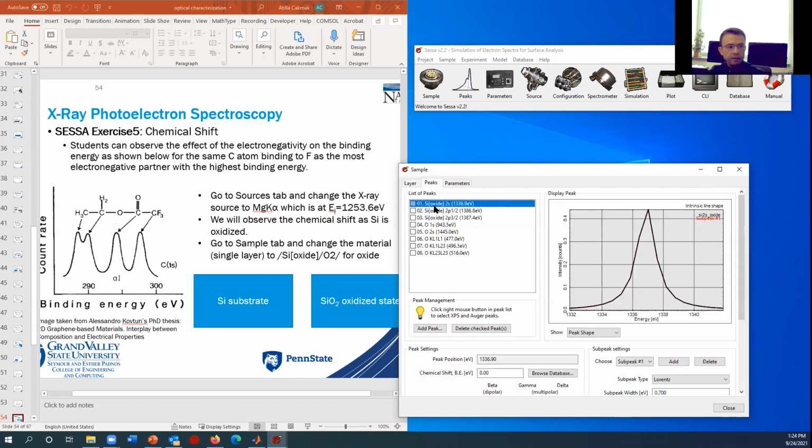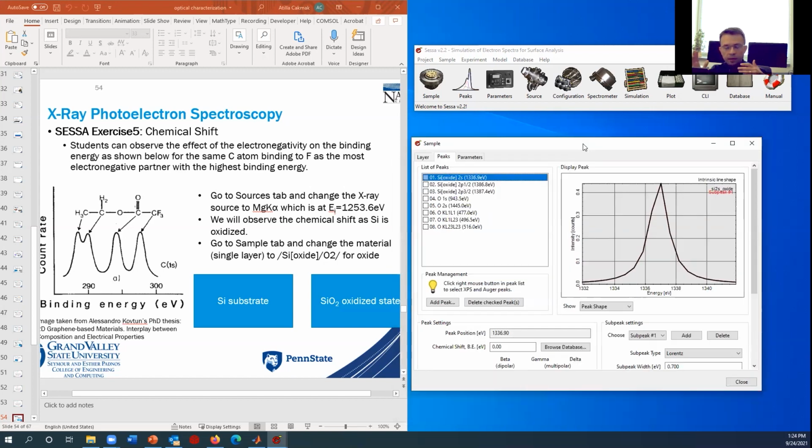And if you look at the peaks, it will bring me my oxide peaks together with the oxygen, of course. And it's doing its best to compensate or try to integrate both of them. And if we look into the peaks, now because of the fact that it's oxidized, silicon is not silicon anymore, it went into a chemical reaction, right? So the silicon material will not give me the same kind of peak locations because now it's under the influence of the oxygen atom too.